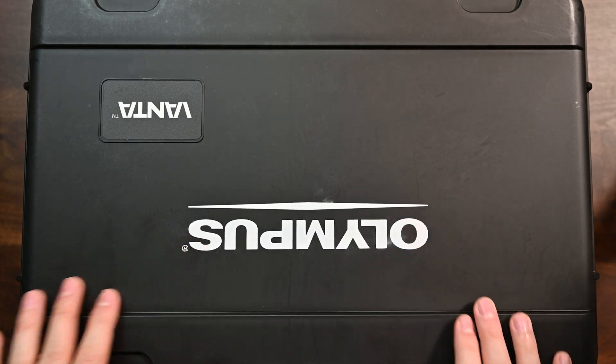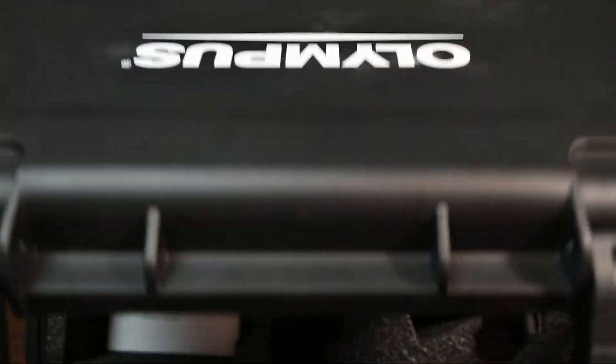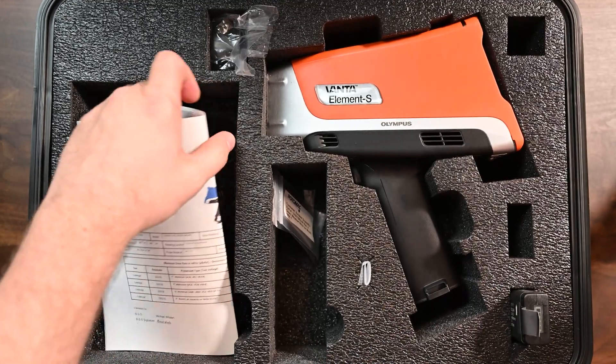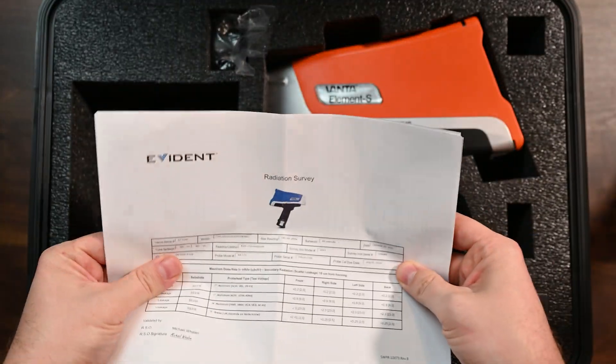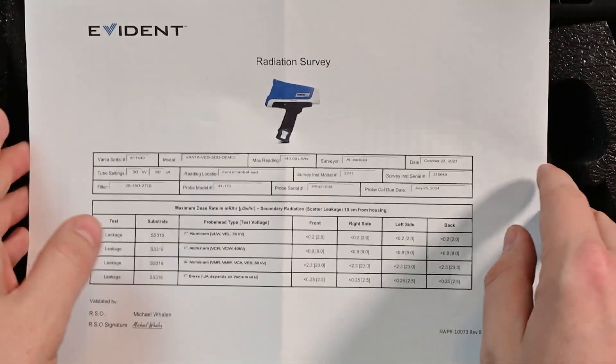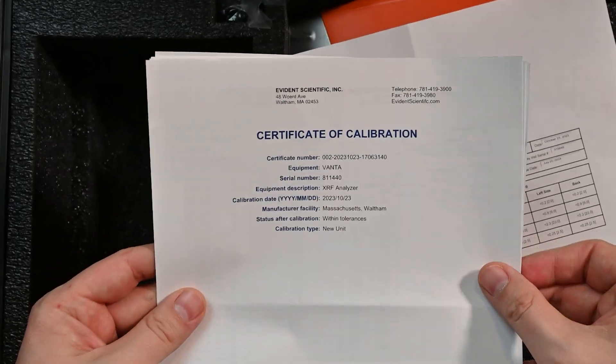Let's take a closer look at the Vanta Element S. You can see there's a nice case here — pretty standard Pelican case. Inside, I want to go over this paperwork so you guys understand what this is and why it's important. The first thing to note is that we have a radiation survey. You're going to need that when you register the instrument with your local government, and then there's also a certificate of calibration.